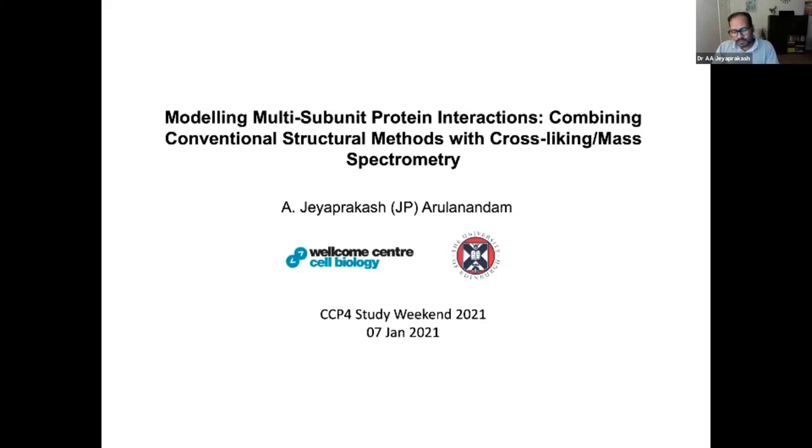I want to start my presentation with a disclaimer that this presentation is more of a user perspective of how cross-linking mass spectrometry can be combined with structural data obtained from traditional methods such as X-ray crystallography or cryo-electron microscopy. So I'm not really going into the technical details of cross-linking mass spectrometry.